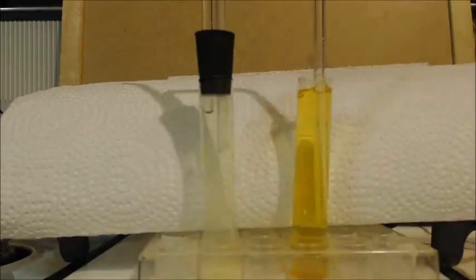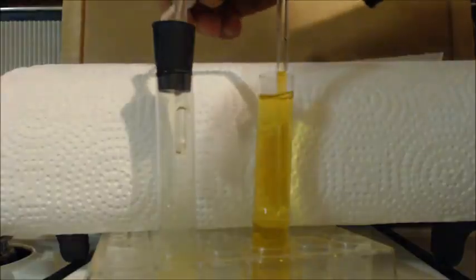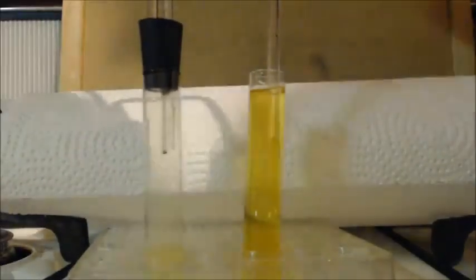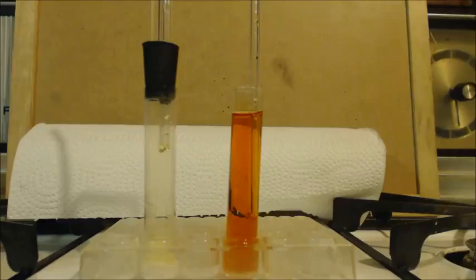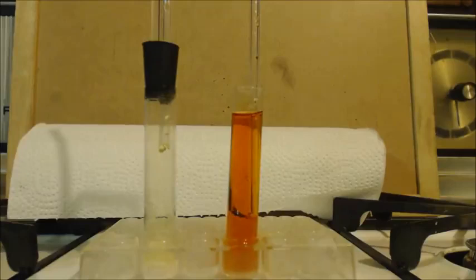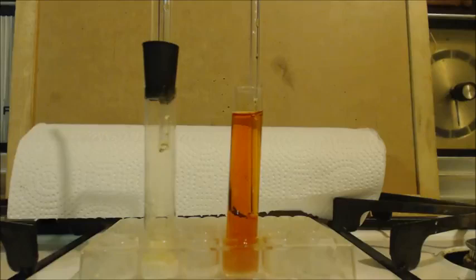I don't know if you can see that on camera, but it turned red as soon as it went in there. Green is still there though. I guess I didn't put enough hypochlorite in there. It's not producing any more chlorine. I'll put some more hypochlorite in there and some more acid, set it up. You can see it's a lot more red now. You're just replacing one halogen for the other, like when you do with metal. One's a more active halogen, one's a more active metal.